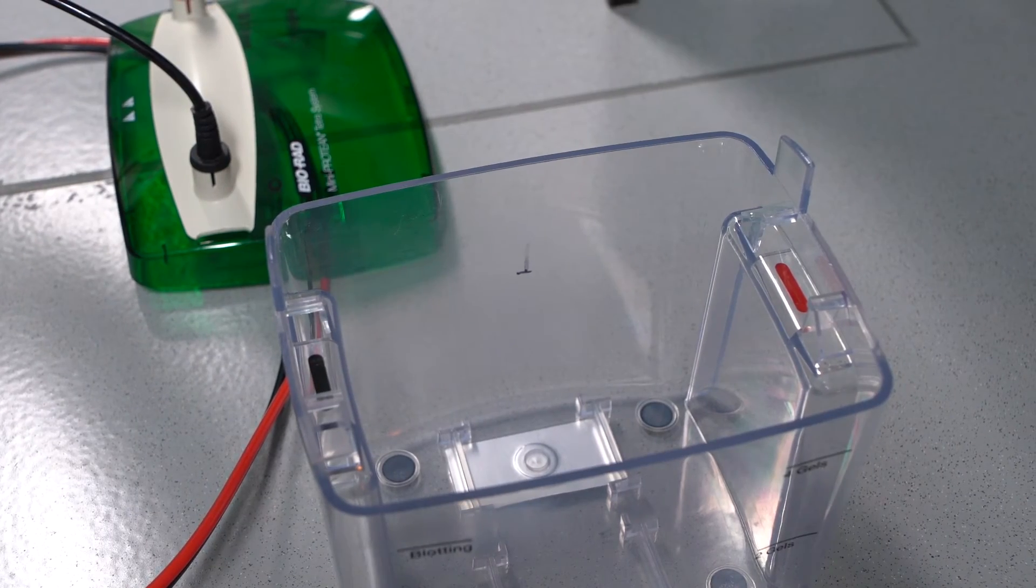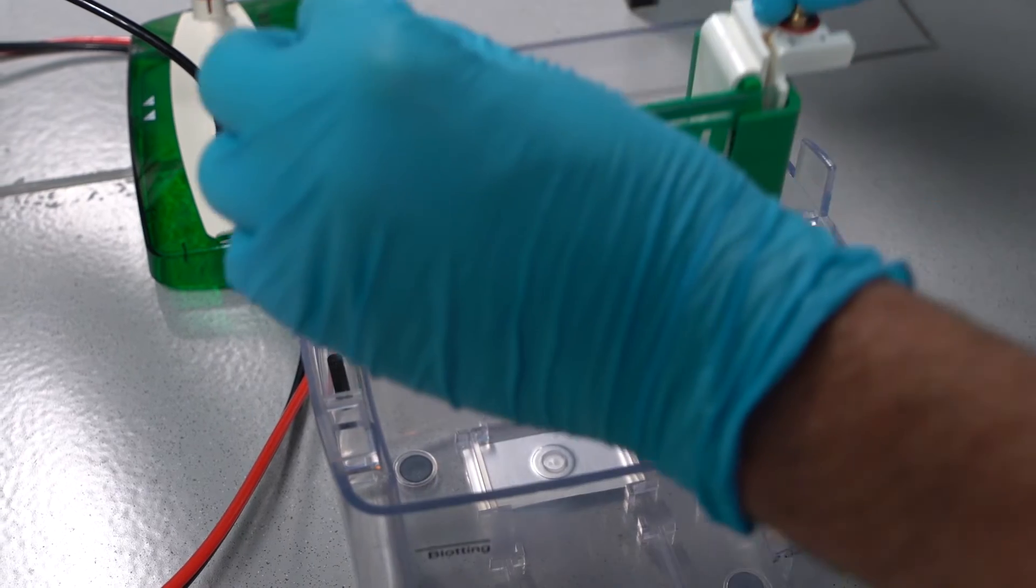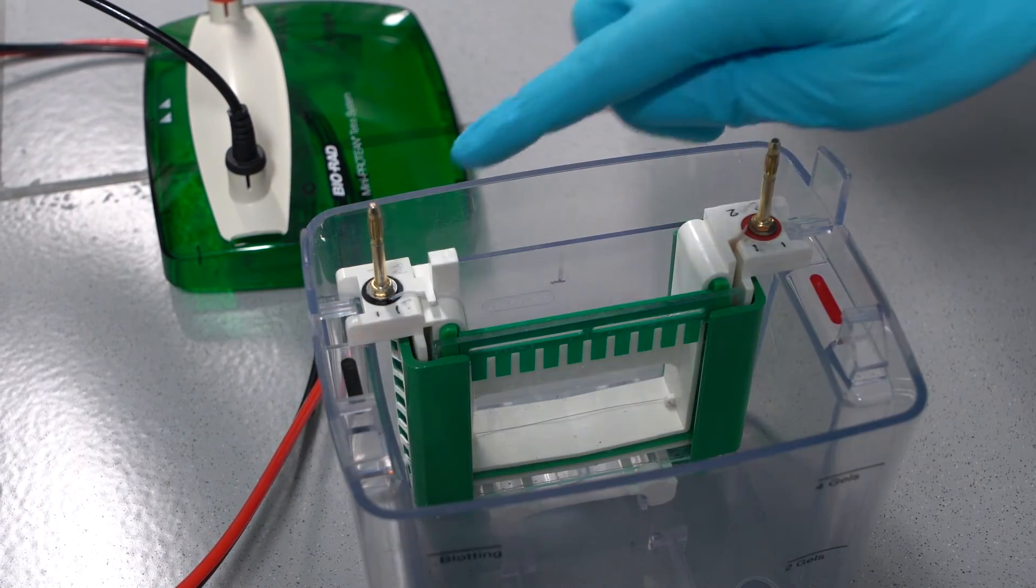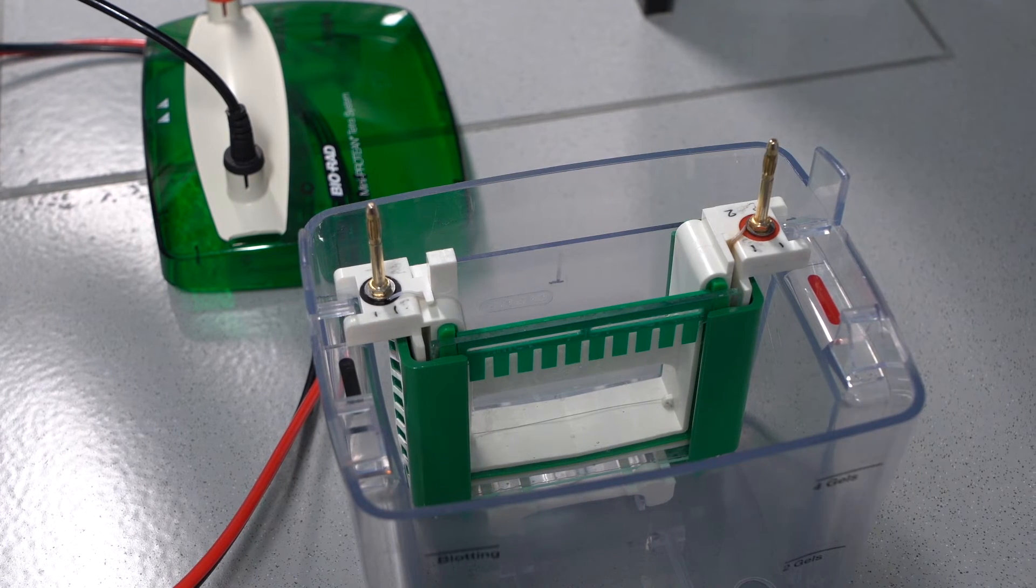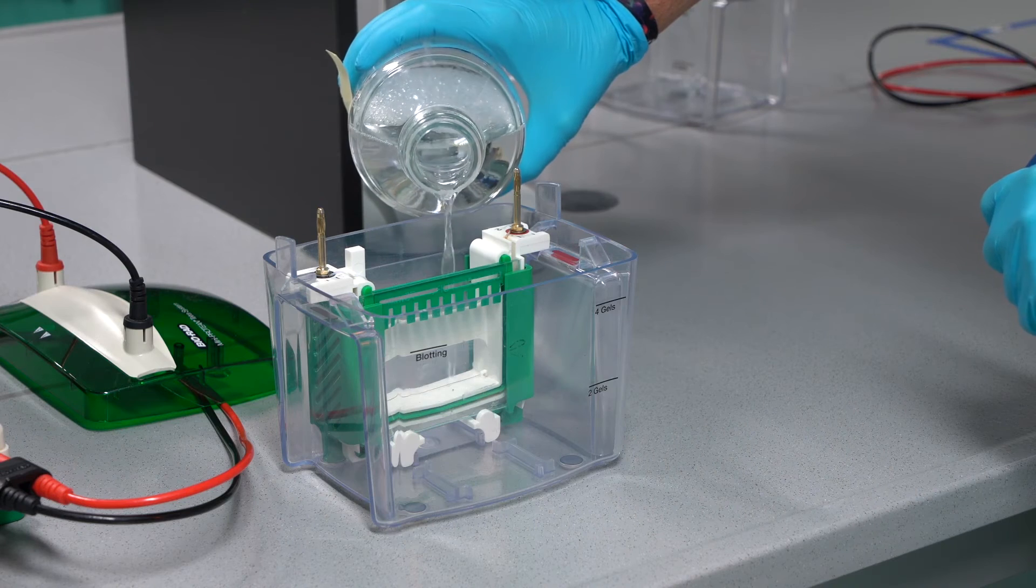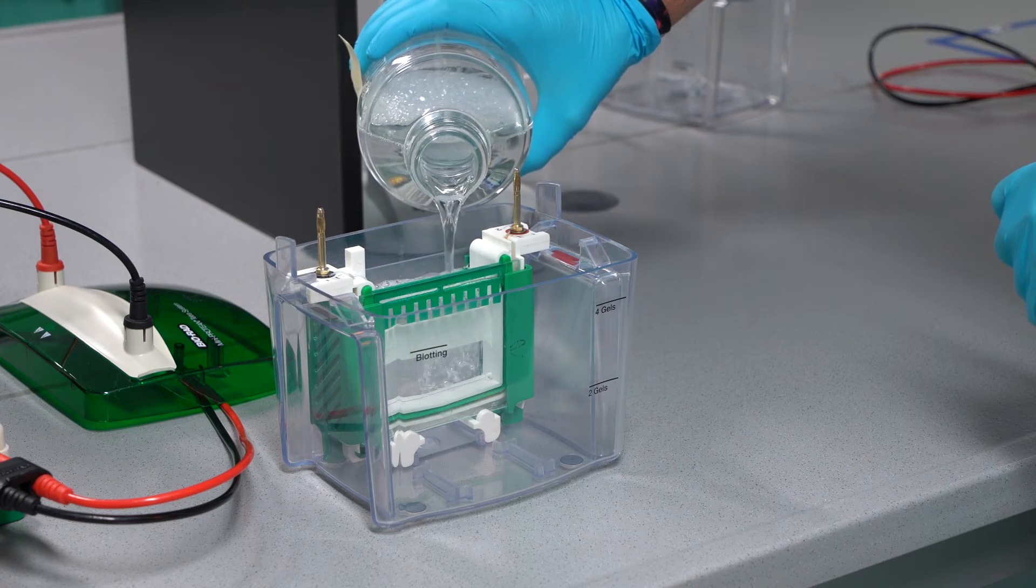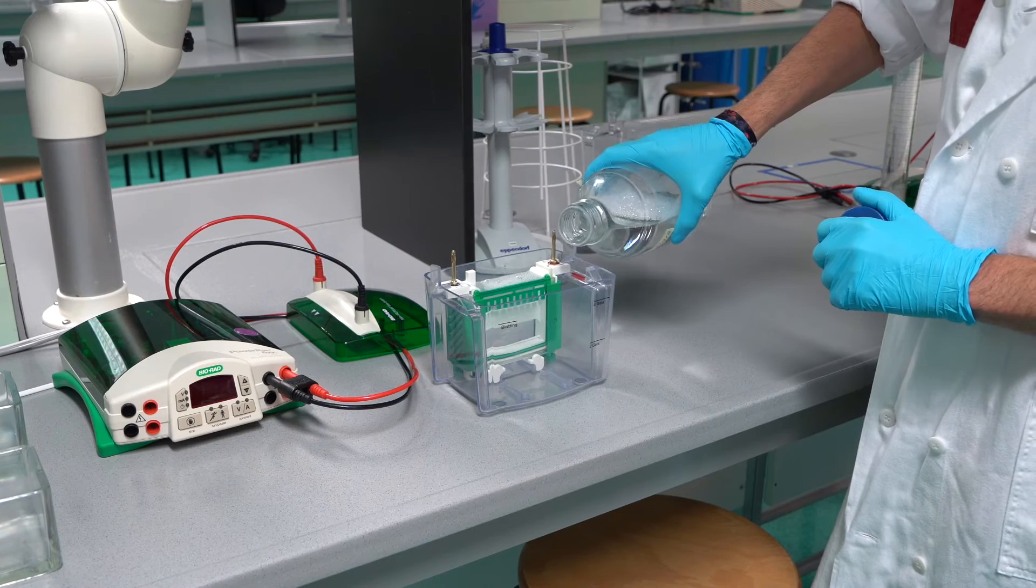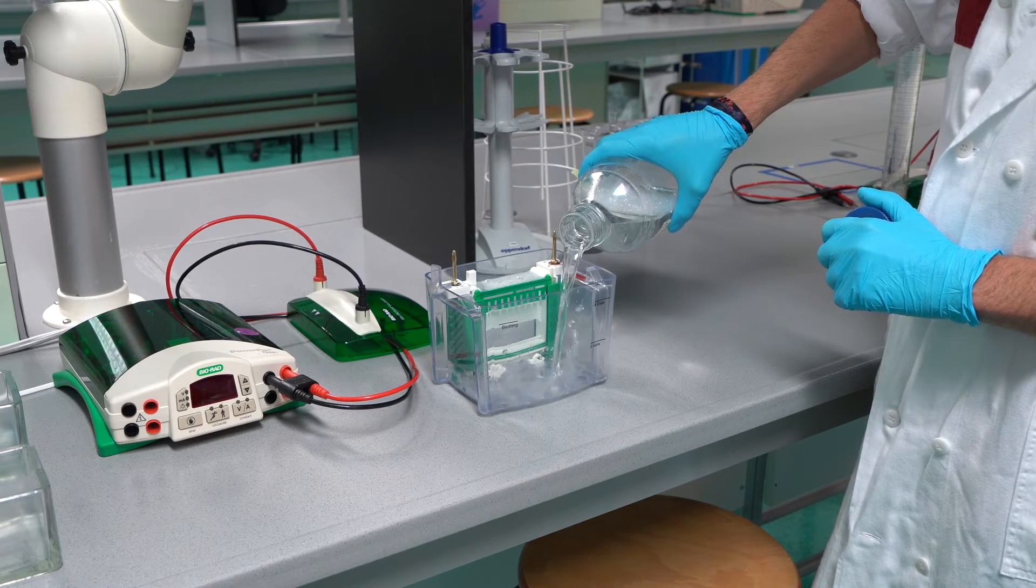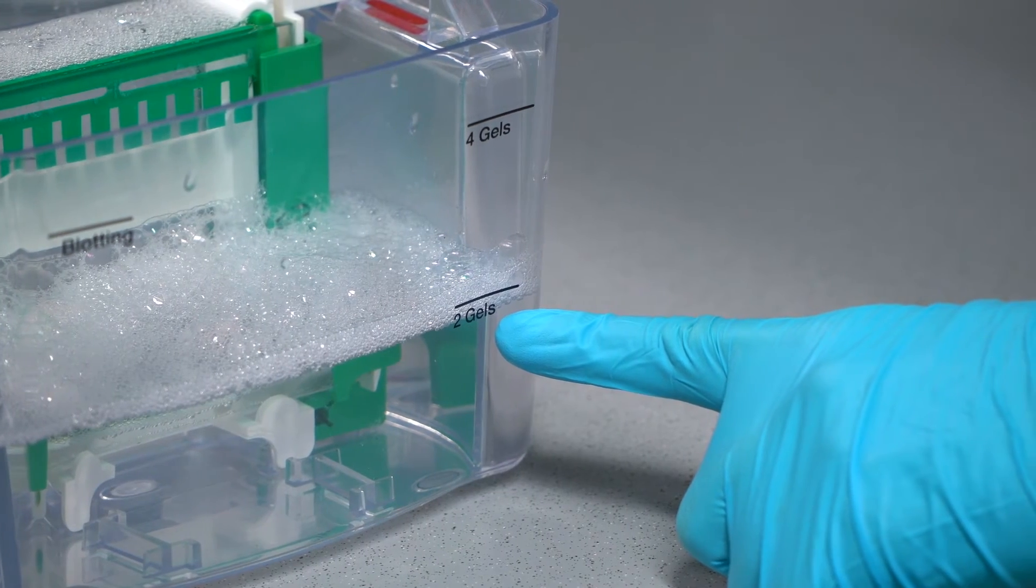Place the frame with the glass plates into the tank. Pay attention to the orientation of the frame with respect to the tank. You need to be able to connect the poles. Fill the interior chamber with one times page electrophoresis buffer. Ensure that the buffer level rises above the small short plate. Also fill the container to the mark of two gels. The current can now flow through the gel.